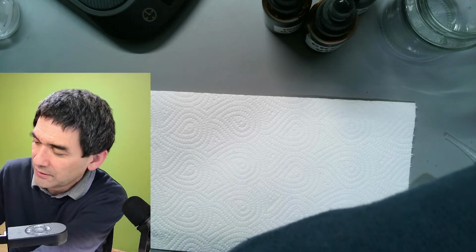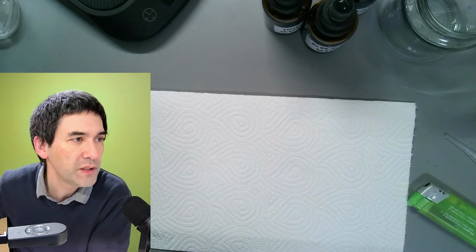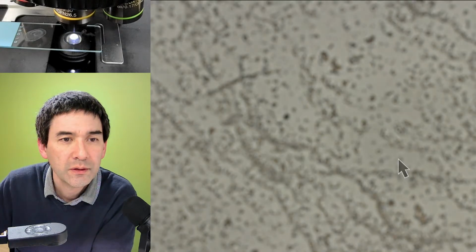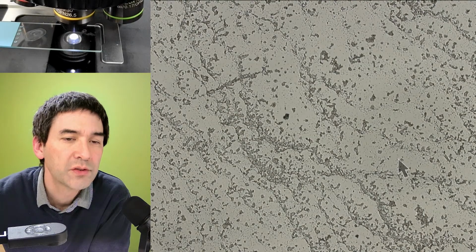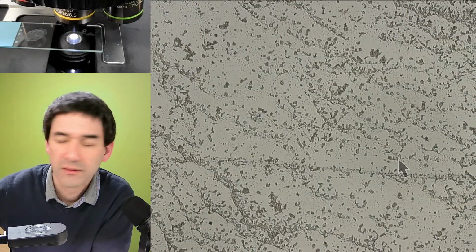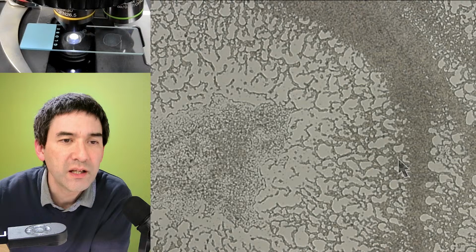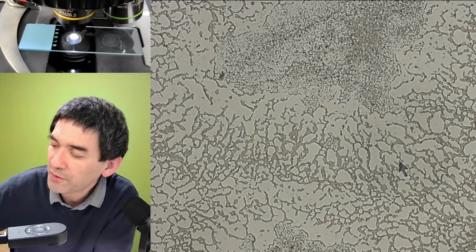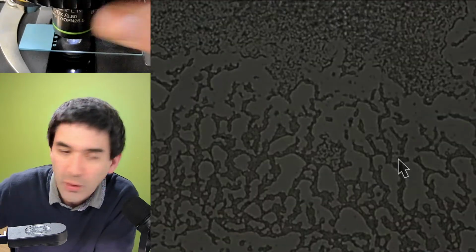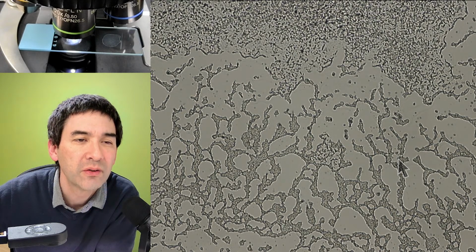I mean, we already looked at it before, but now let's have another look, just for the fun of it. Where is the microscope view? Here we go. So that's basically how it looks. And over here, these are the other ones. You can actually see that as the slide dried, the cells were sticking together in this kind of pattern. But now, because there is no liquid here, I can easily go up with the magnification as well. Okay, all those cells are kind of sticking together.